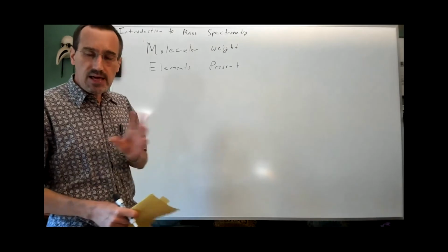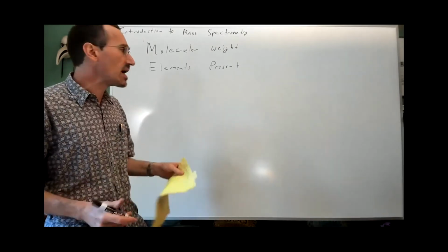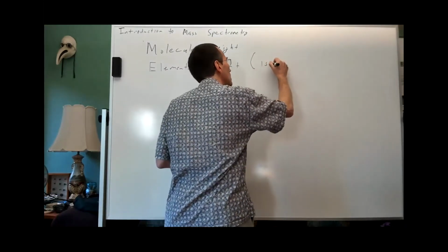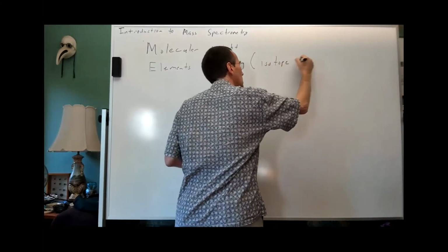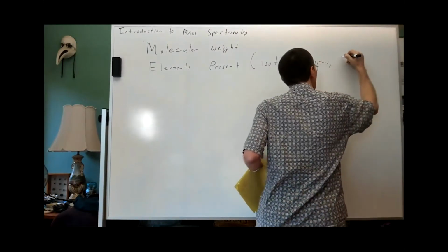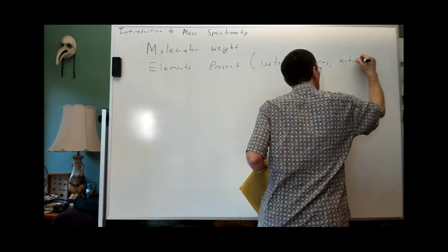You're also going to be able to learn, oh, there's a nitrogen in the molecule, or at least in some cases you will. So we're going to be learning about isotope patterns, and I'll briefly touch on the so-called nitrogen rule.